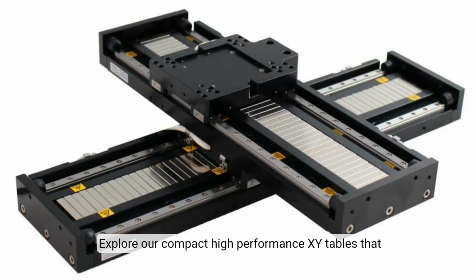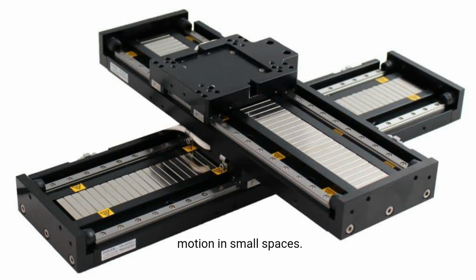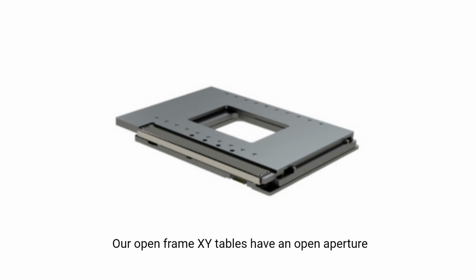Explore our compact, high-performance XY tables that utilize stacked individual axes to create precise XY motion in small spaces. Our open-frame XY tables have an open aperture that allows for illuminating a sample from one side with the camera, optics, and objective on the other side of the sample.